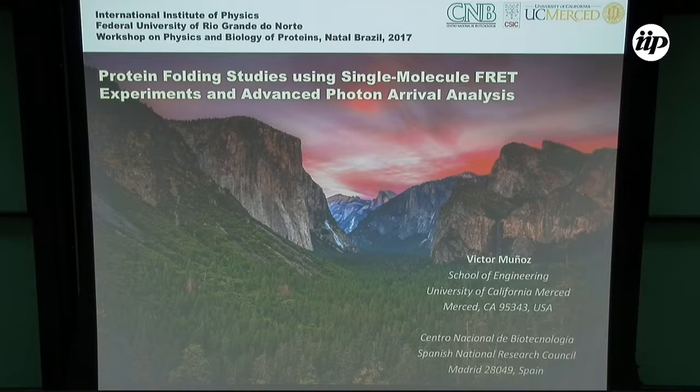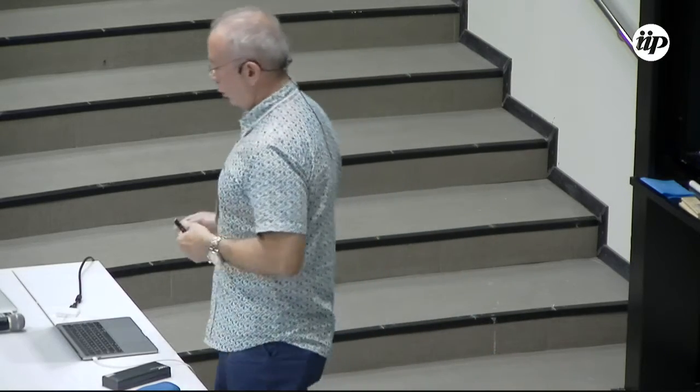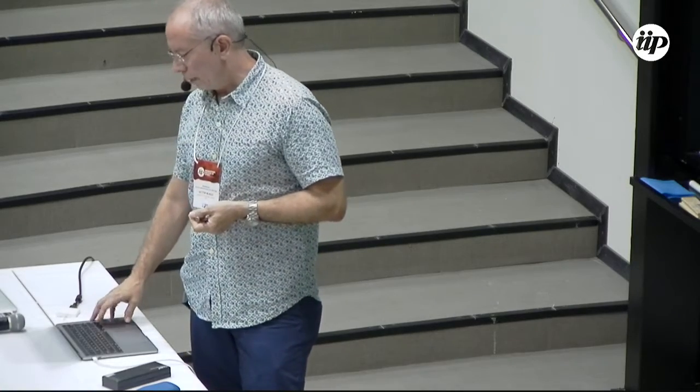Okay, thank you, Dimitri. So now I'm going to be telling you about a third technique that you use experimentally, which is single molecule FRET, or fluorescence. I will show some examples of things that you can do with this technique and also discuss a little bit the challenges and how you can go about them.